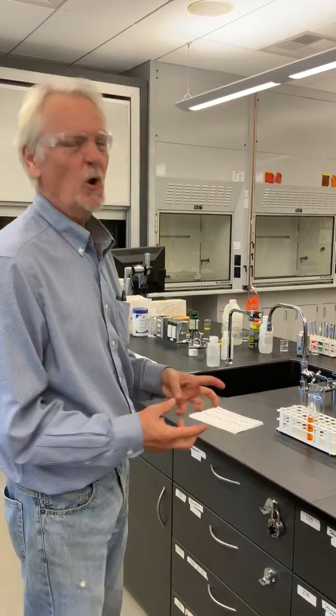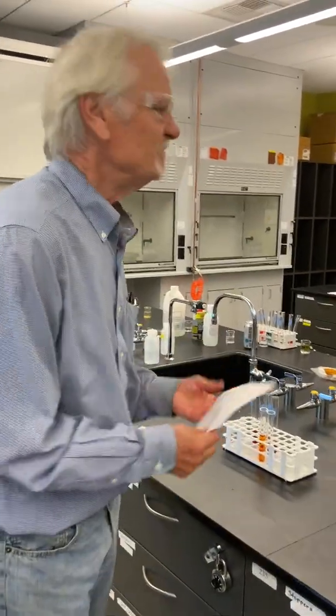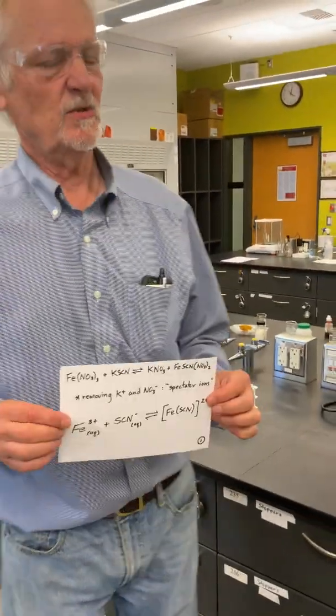It's hard to show you this equilibrium system because we kind of need something that has color, and the color then can substitute for changes in that equilibrium. And so our most common demonstration involves the formation of complex ions, which are the vividly colored ions in nature. We don't say anything really about them in Chemistry 121.